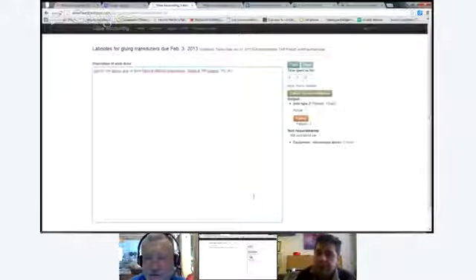All right. That's a good question, Bob. Can I work on 2 projects at the same time? So can I have 2 lab notes open at the same time now? Yes, you can. Of course you can. So there is no problem with the database there. This is a good database.